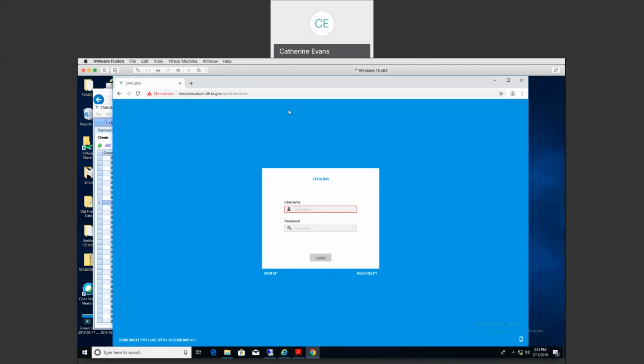We're going to discuss 4 things. The first thing that we're going to discuss is how to search for and create new patients in the system. The second thing we're going to discuss is how to log in samples and assign patients to those samples. And we're going to go through various scenarios of how to log in samples.